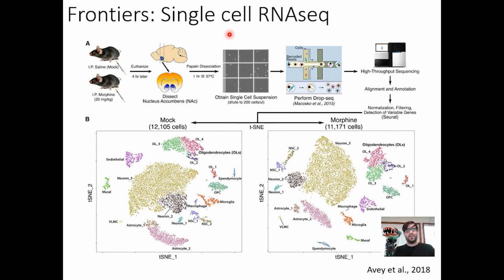But in general, individual cell types will have different responses. If we think about a leaf, it has cells that are doing photosynthesis. They have cells that form structure. Some of them form the epidermis, or the outside layer of the plant. Some of them would function in the phloem or xylem. Sorry, not the vacuole, the phloem or xylem. They might function in transport, etc. So each individual cell type might have its own separate response. So maybe we want to see how individual cells are responding and how they're different. And this is what we refer to as single-cell RNA-seq.